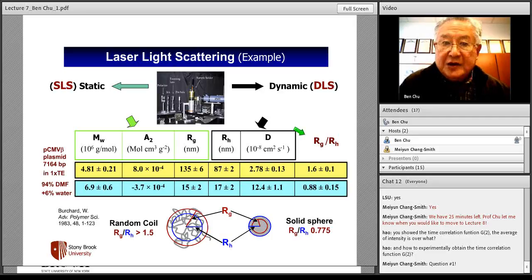measurements. This will surely be the case also for synchrotron X-rays, especially now at NSLS-II, with very high flux of X-rays, which will decompose polymer solutions, polymer molecules, fairly quickly, and you have to think about flowing it to see the effect due to decomposition and other things.